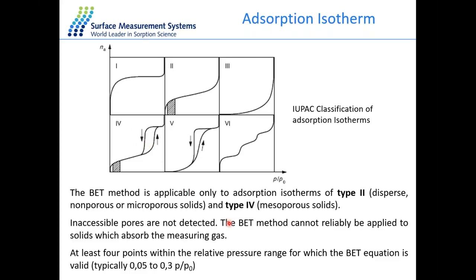Unfortunately, the BET equation is a linear equation and very often can give linear results with a good R squared to isotherms that are not of the right shape, but you can get an answer. So it's very important to make sure that first your isotherm, which I'll show you some examples of later, is of the right type to make sure you're applying the right equation. So the model only applies if the gas or vapor is sorbing on the sample in the appropriate manner.